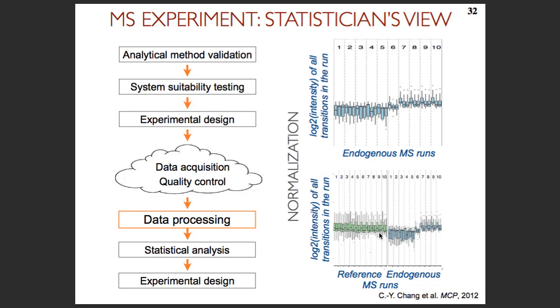So designing the experiment to minimize batch effects, using techniques such as blocking, right, and incorporating standards at different steps of the procedure to minimize the assumptions, is a really good practice. But again, it's really hard to think about this type of design if you don't have the analysis in mind, right? And this is why we need to go through the whole process.